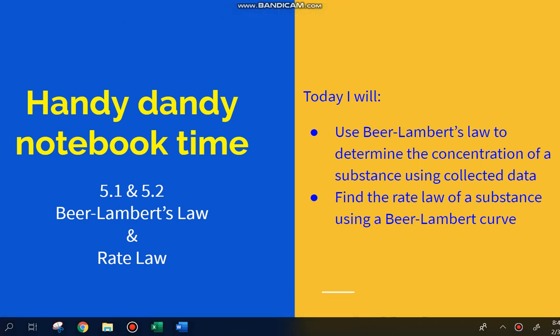Hey guys, today we are going to be looking at Beer-Lambert's law and a rate law, and we are going to be doing the rate of reaction of the fading of crystal violet. So go ahead and pause the video and take just a minute to look at these learning targets.